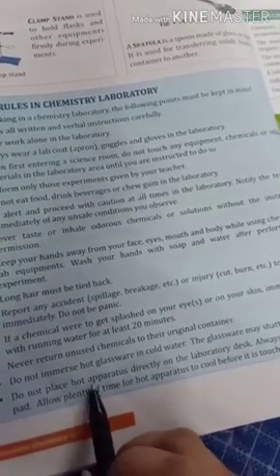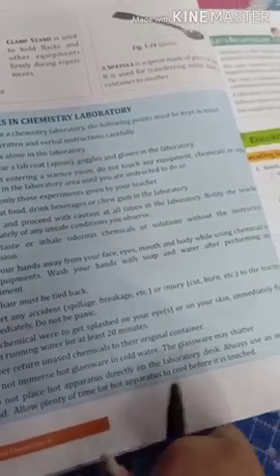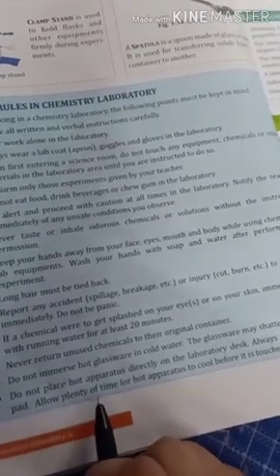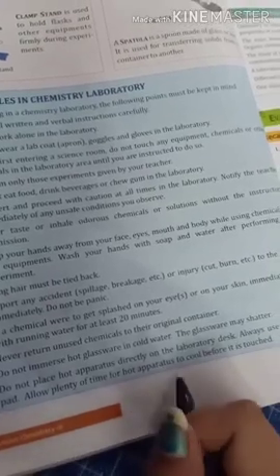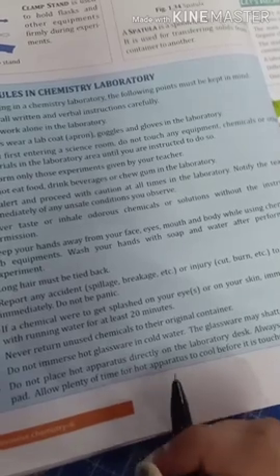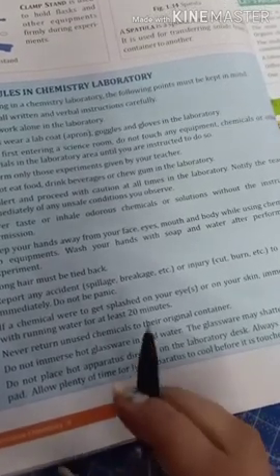Do not place hot apparatus directly on the laboratory desk. Always use an insulated pad. Allow plenty of time for hot apparatus to cool before it is touched. So don't touch hot apparatus directly. For that purpose, you have to use tongs.